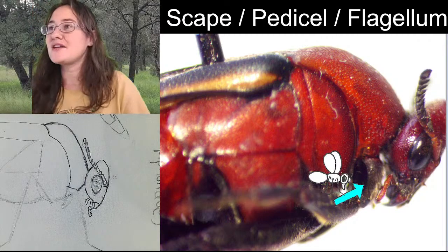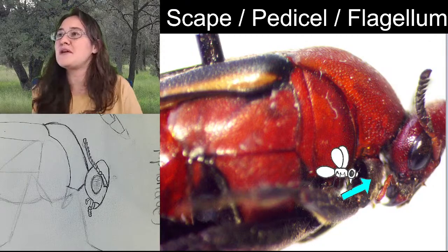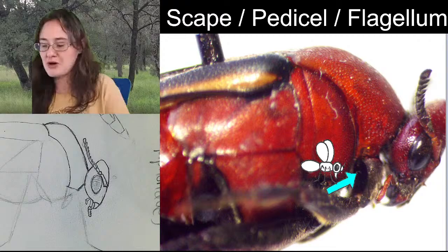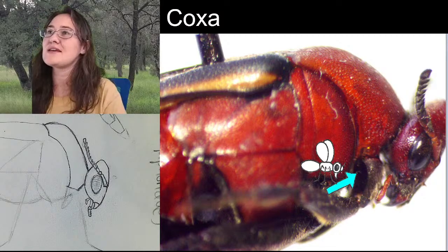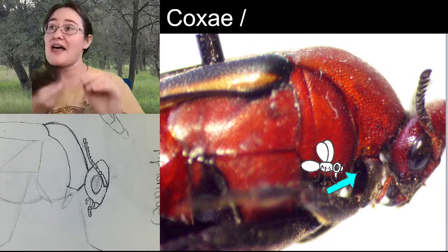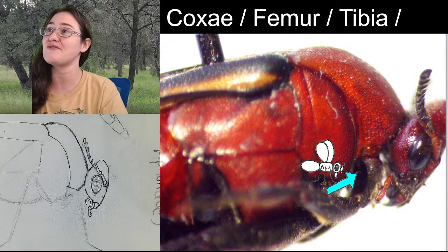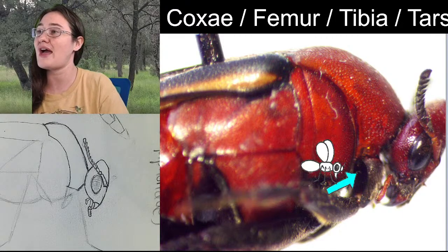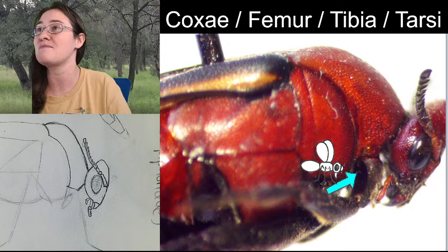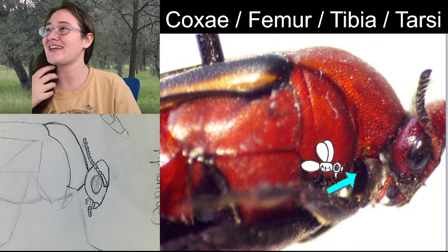And I went ahead and checked the microscope just to be sure. But yes, this dark segment right here, that is the coxa, kind of like the hip bone of a leg. We spell it like this. And then plural, they're coxae with an E. And that's the hip bone of the insect. I'm just going to go ahead and give us the rest of our leg parts here so that as we're talking about them down the leg, you can refer to them. And I only have to type them once. So that is the coxae right here.